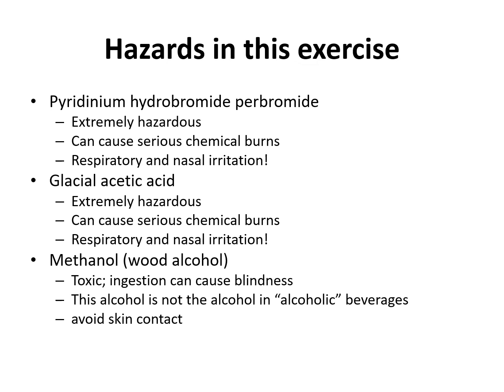So, for instance, the bromine source compound we are using here is extremely hazardous, and it can cause very serious chemical burns unless you take care from getting in contact with the chemical. It can also lead to respiratory and nasal irritation. In the same way, the glacial acetic acid has similar safety traits, so they must be handled with great care.